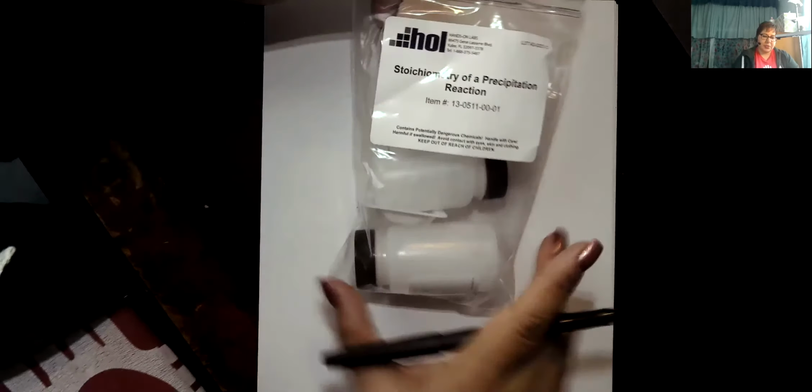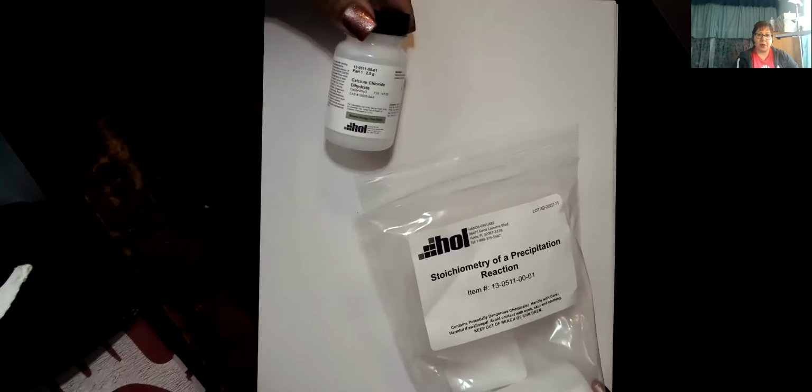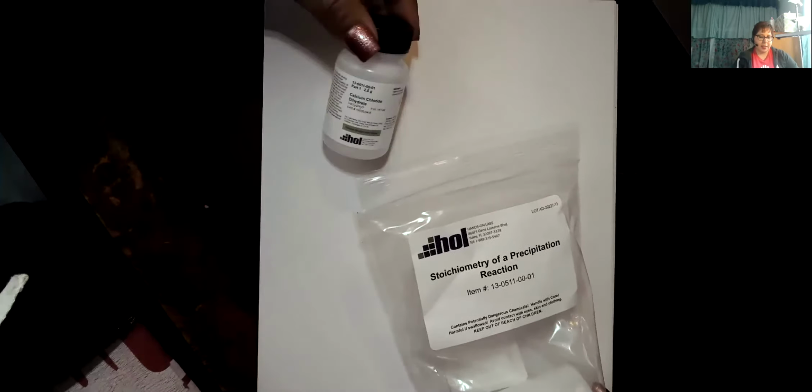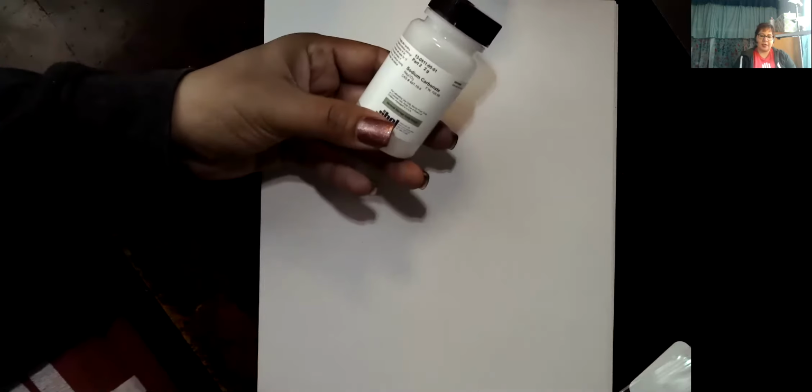So your lab kit is going to have a little envelope that looks like this. It says stoichiometry of a precipitation reaction. So you'll need that envelope. It's going to have in there a little bottle of calcium chloride dihydrate. It's also going to have a little bit of sodium carbonate. And we're going to use these compounds as our starting materials for this week's lab activity.